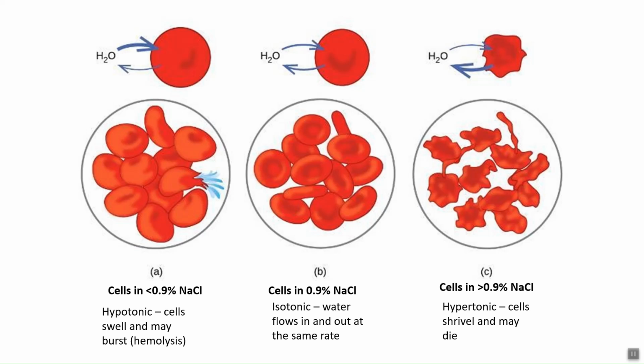So this is basically just a little introduction to osmotic pressure and osmosis, and it's not super important here, but it is what we're trying to do. We're trying to figure out if the unknown solution is basically safe to be used inside of a person. Obviously, it's not actually safe because it's not sterile or anything like that, but we're trying to determine, if we worked for a company who makes saline solutions that go in IVs to put into people, does it have the right concentration? Because as you can see from this, it's very important that it has the right concentration.